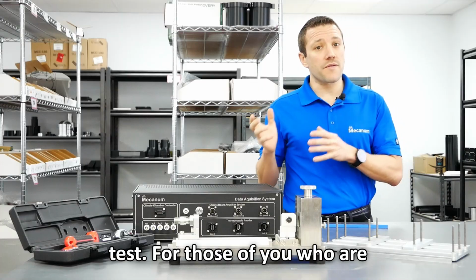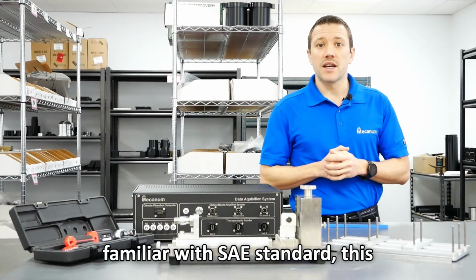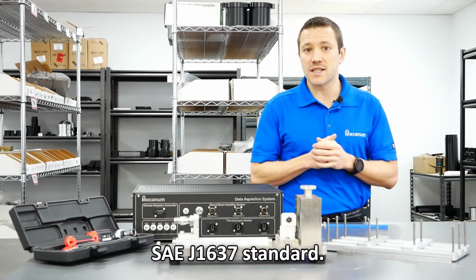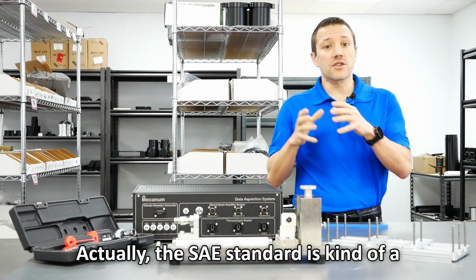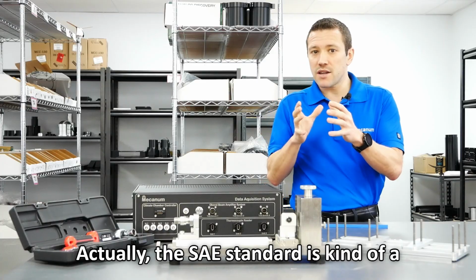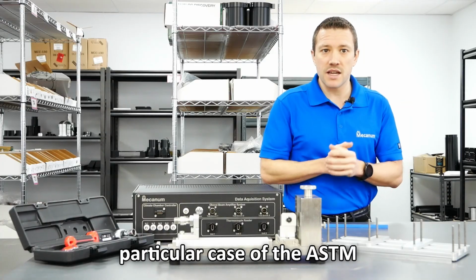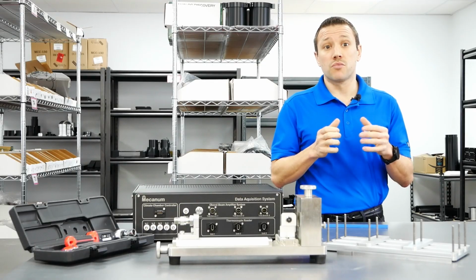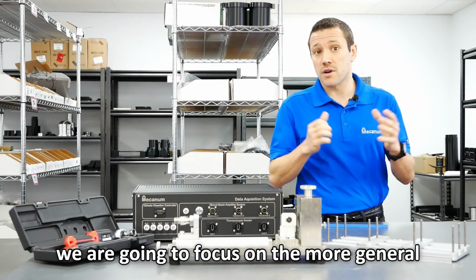For those of you who are familiar with the SAE standard, this is also similar to the SAE J1637 standard. Actually, the SAE standard is kind of a particular case of the ASTM standard. So today we are going to focus on the more general ASTM standard.